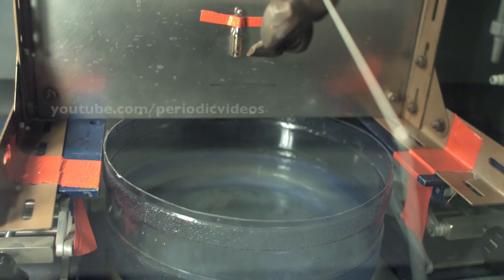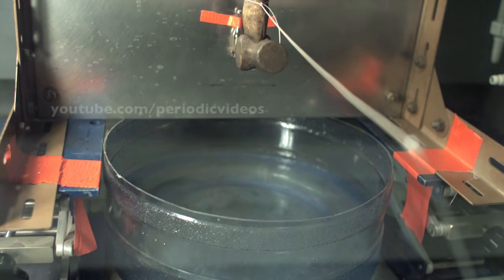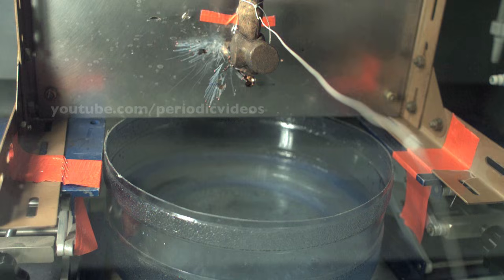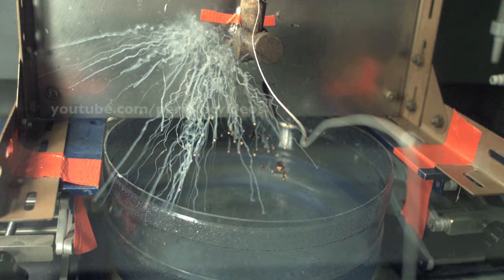Because high-speed filming needs very bright light, the heat of the light made sure that caesium, which has a low melting point, was nicely liquid before we broke the ampoule.